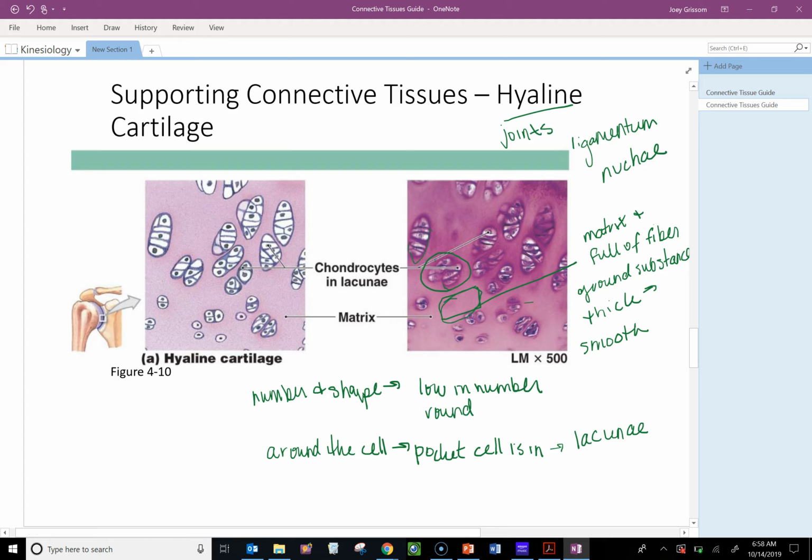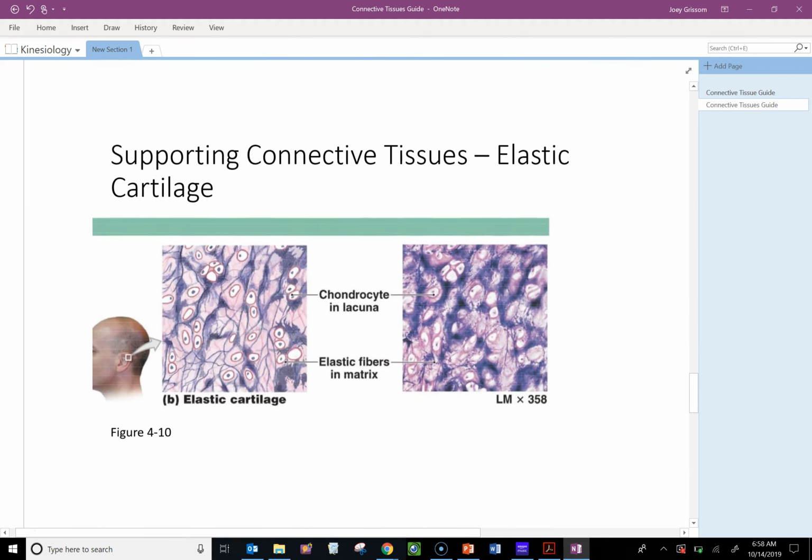So if you're seeing a bunch of little pockets of tissue, of these cells, interspersed with this very sheer, continuous, non-fibrous looking thing, that's your signal that it's cartilage. Okay. So those two things will tell you it's cartilage.